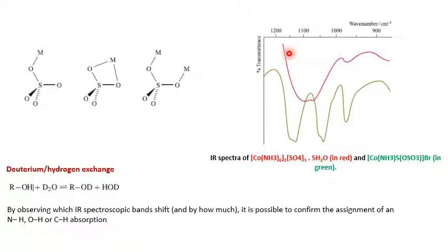However, in the second example, this pentaamine cobalt sulfate salt, where sulfate is bound to the cobalt center and bromide is the counter anion, you can see in the spectrum shown in green that there is splitting in that region. This is because sulfate is binding through one oxygen atom to the metal center, and because of binding, the pattern changes, and you get that fine splitting structure in the IR spectrum.